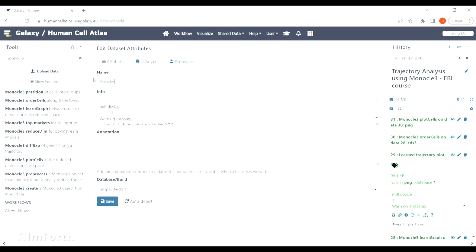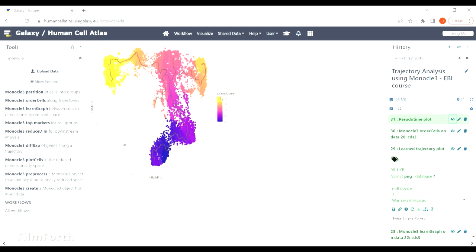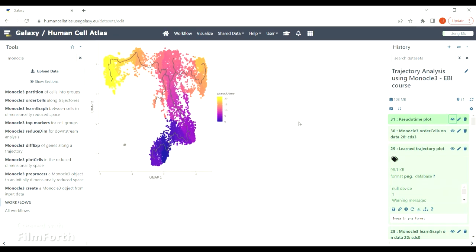All the work you've done was to see this beautiful colorful plot that shows development of T cells. I'll say that once more: for more biological insight, please do have a look at the tutorial.